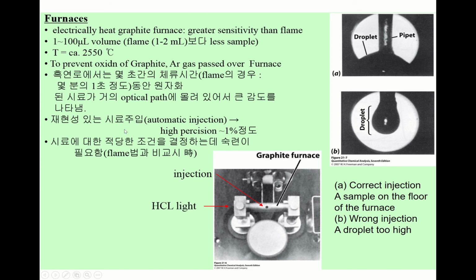With a very reproducible sample injection, probably using an automatic injection method, you can achieve high precision, about 1%. This is quite a good one. But you need practice. You need time to practice yourself.